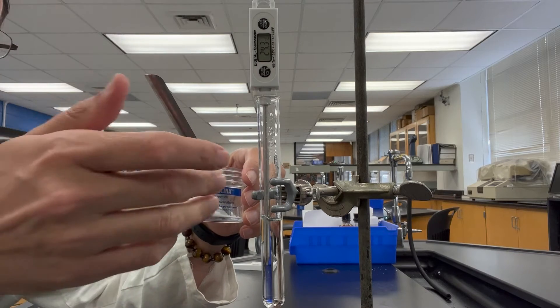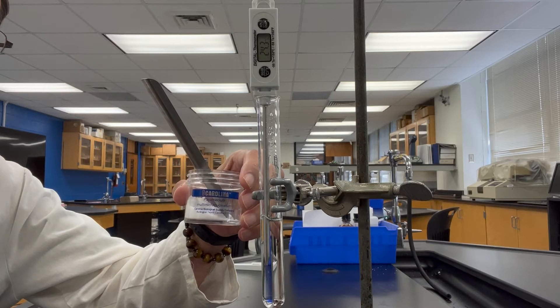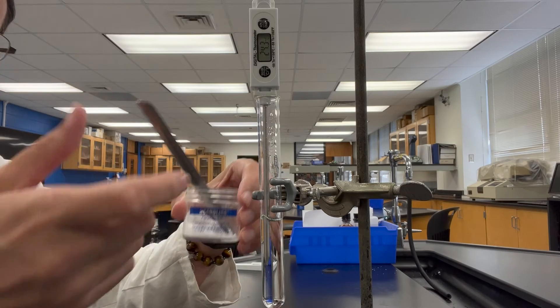I'm going to pour about four or five scoops in there and just let it sit. I really can't stir this up much, and we'll see what the temperature looks like.